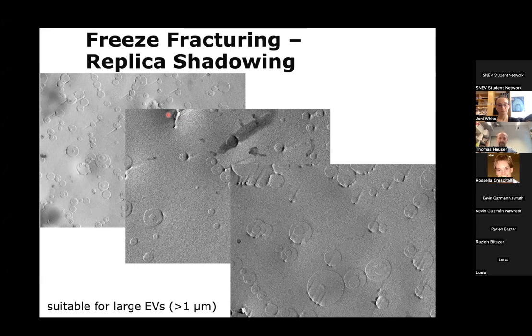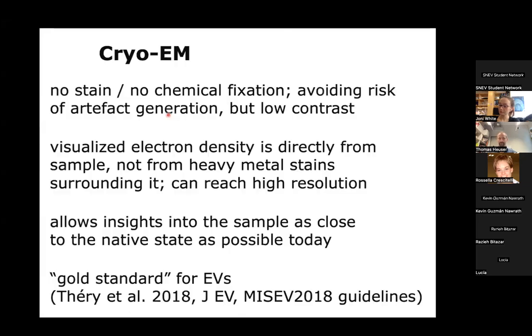But again, here as well, you will not have the resolving power to see the double membrane. Good.